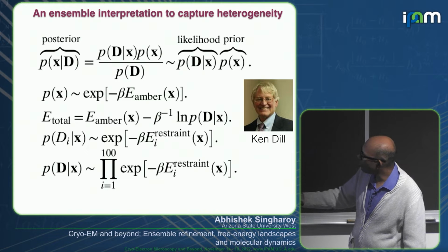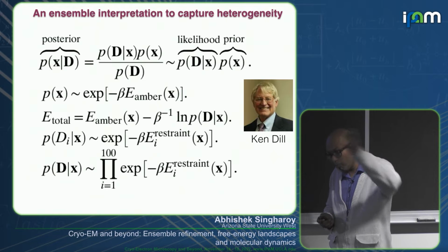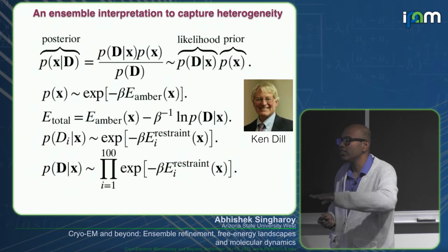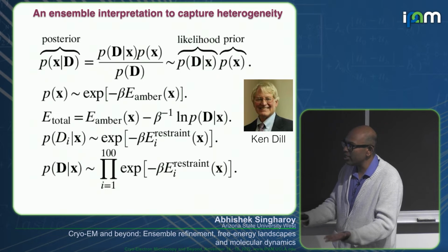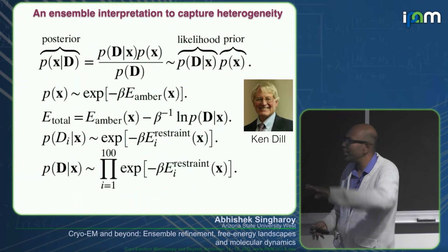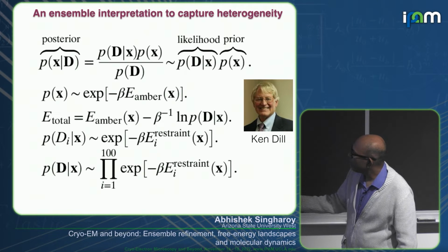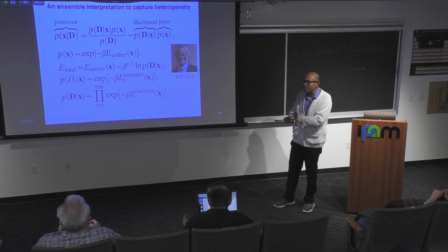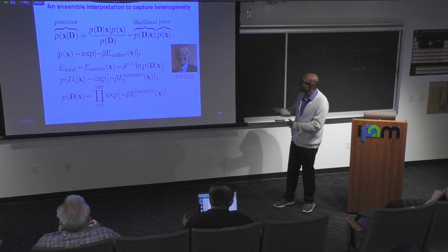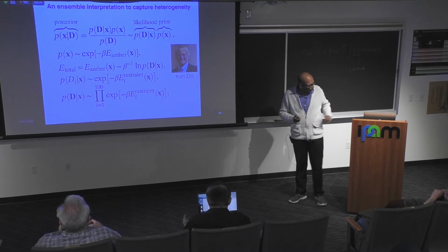Now, what we figured out is, if you give up on the idea of overcoming transition barriers, and you're simply interested in the energy minima, most of my ensemble is a number of energy minima and not the barriers at all. Then we can come up with a probability function that is a function of products of all the restraints. Restraints coming from the experiments and restraints coming from force fields. And exchange those restraints and generate data out of that.